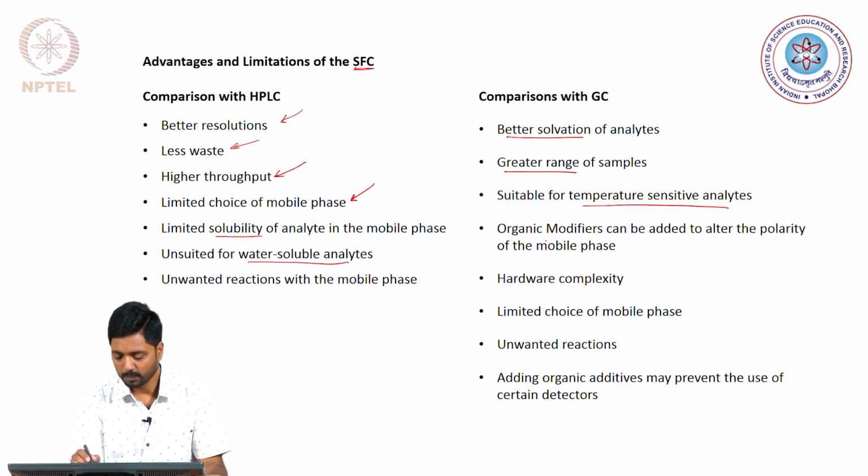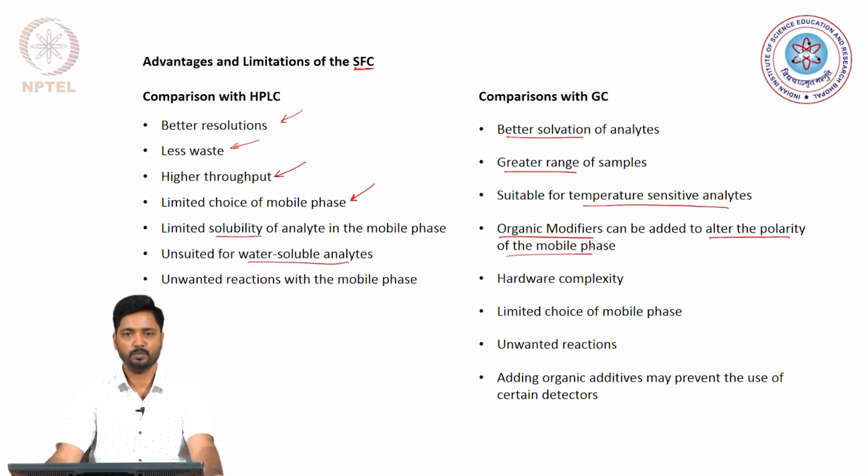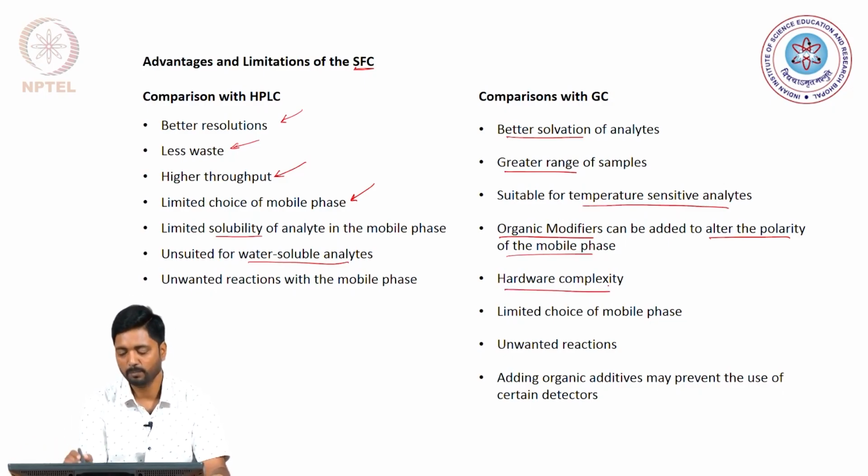Now, one more important point here is that we can use certain organic modifiers to alter the polarity of the mobile phase when using carbon dioxide as the supercritical fluid. However, the challenge that needs to be overcome when using supercritical fluid chromatography is the hardware complexity, and this aspect needs to be explained in detail.